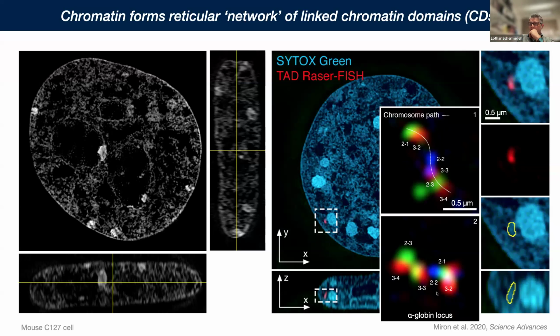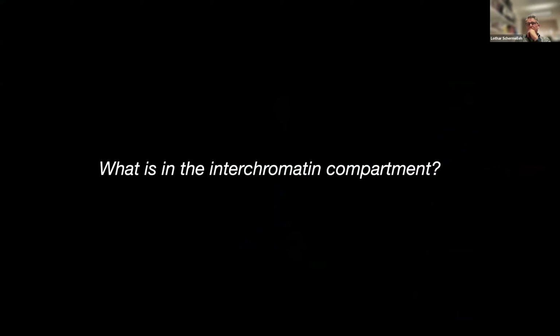There is big cell-to-cell variability, but clearly we have here a chain of domains, if you like.